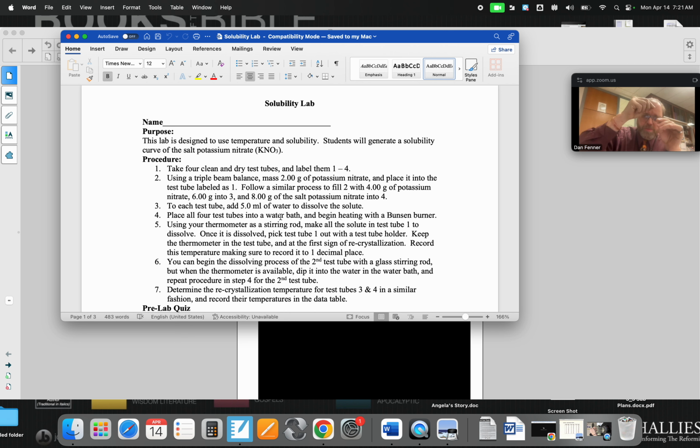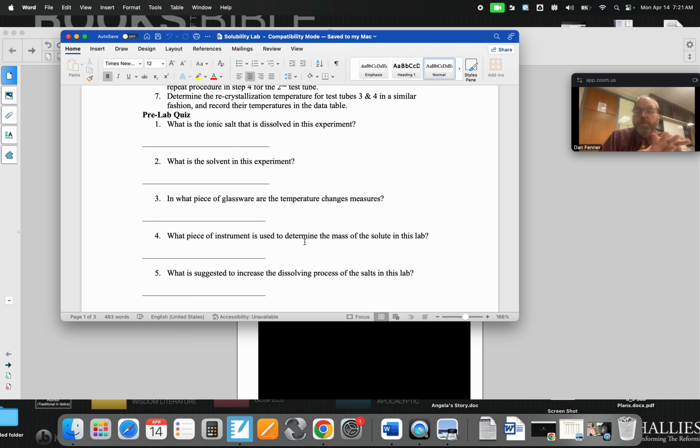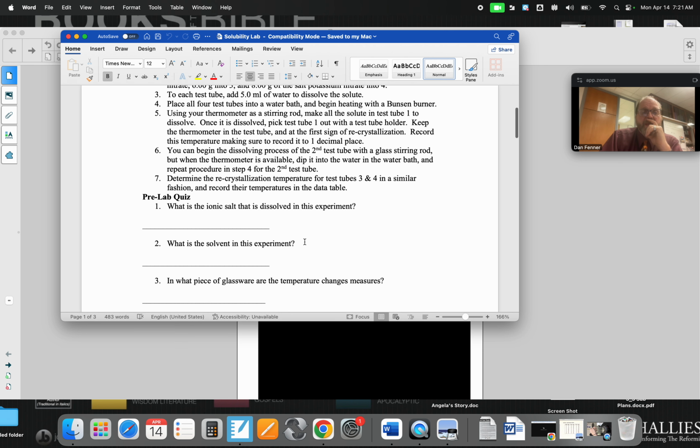I'll show you the video in a second. And then we're going to get the temperature at which they recrystallize, so we can try to get that solubility graph that we have there. All right, so copy that down. There are 5 questions there. So try to take the pre-quiz to see if you understand what's going on in the lab here, and you can refer back to the lab to answer the questions.